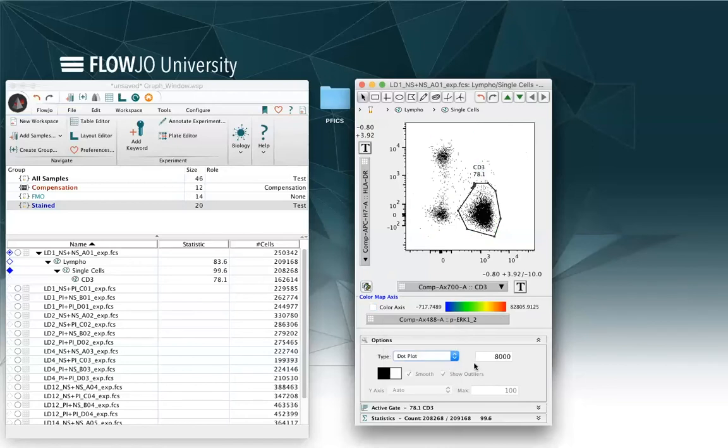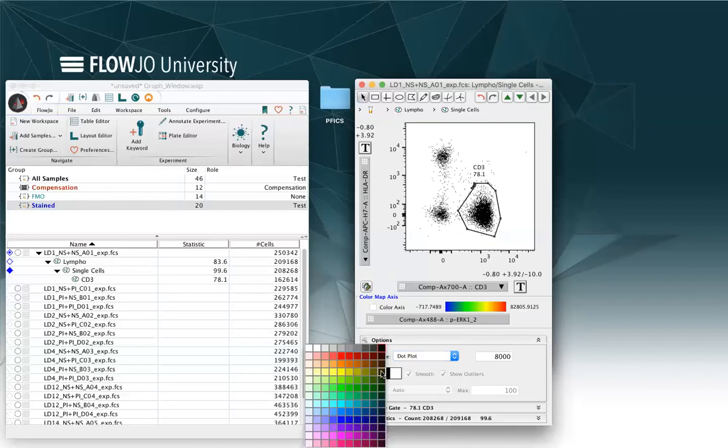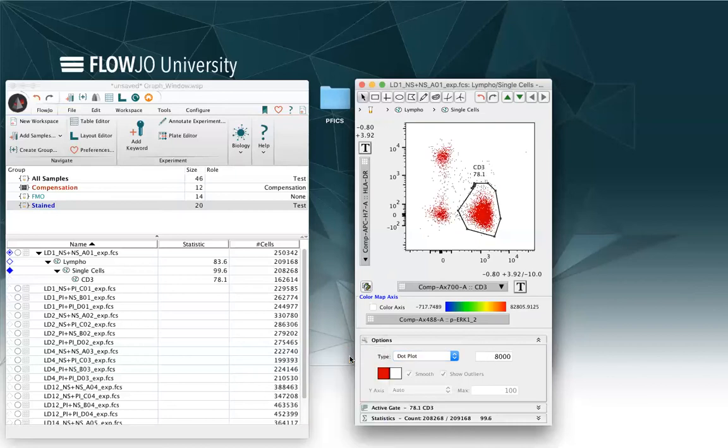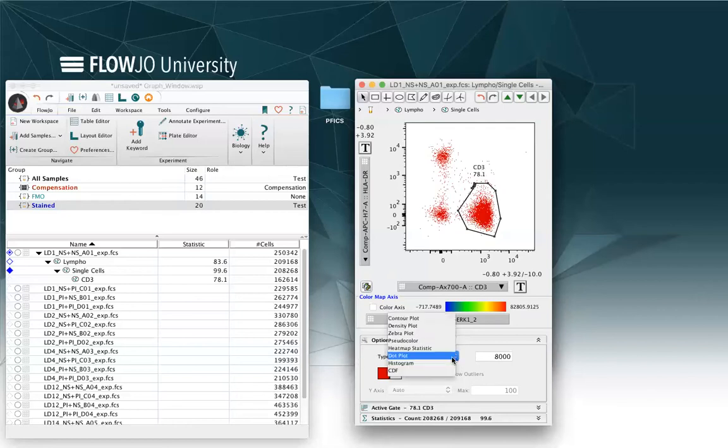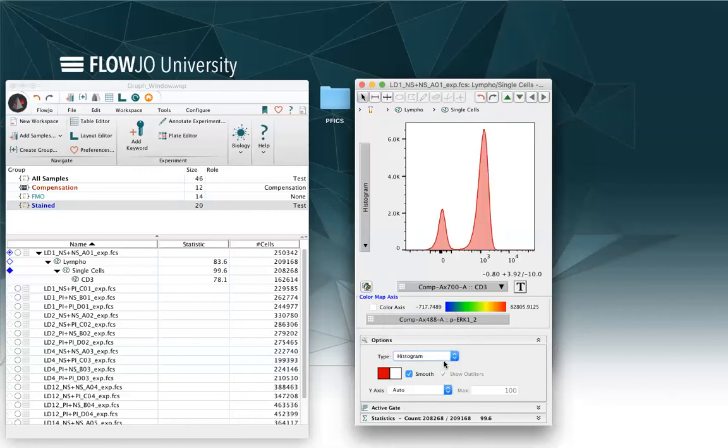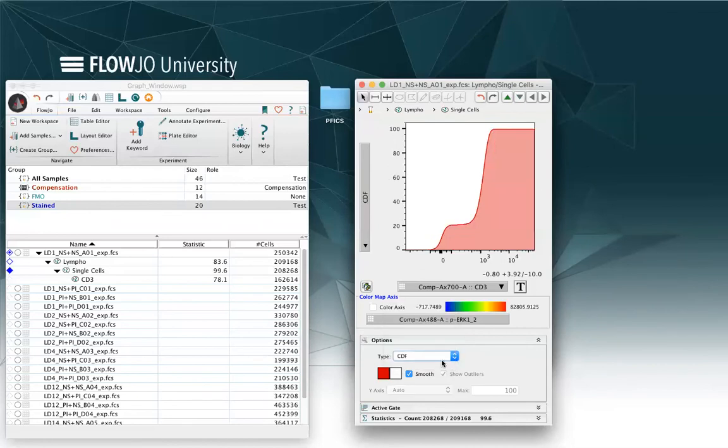A different option is a dot plot where you can choose the number of events to show right here, or you can select a different color for the cells and so on. If I have one parameter to show on the plot, I can select also histograms or CDF.